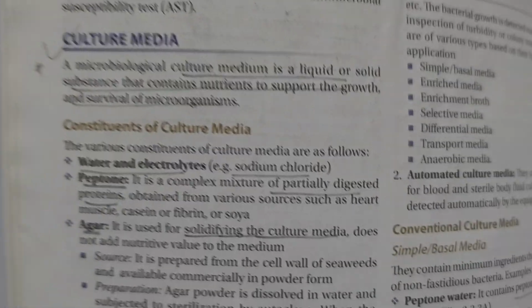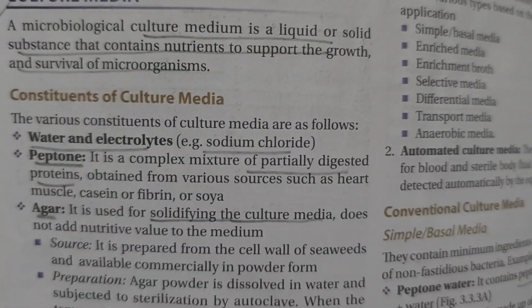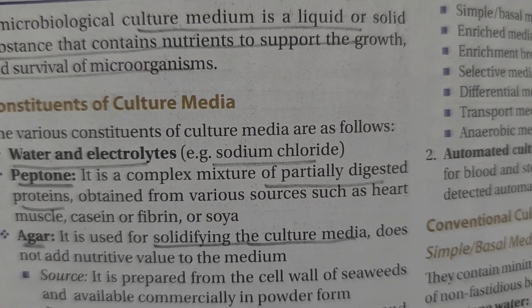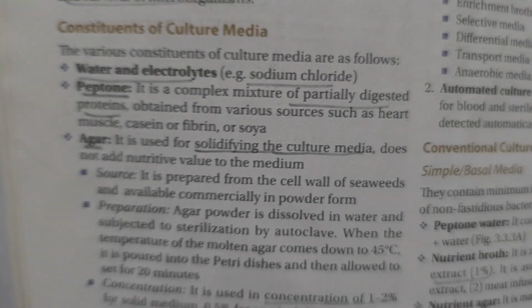Now let's see culture media. A microbiological culture medium is a liquid or solid substance that contains nutrients to support the growth and survival of microorganisms.